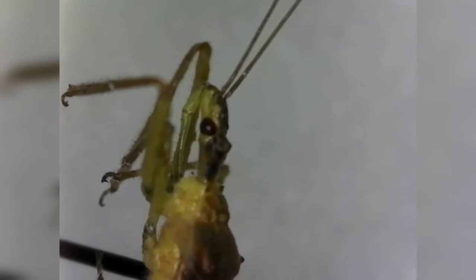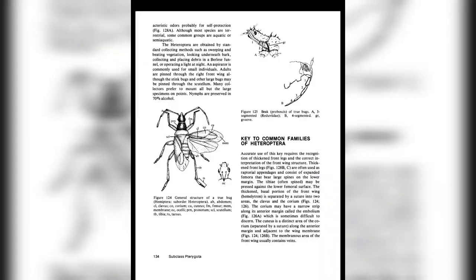First we're going to take a look at the beak to identify the suborder. We can see here that the beak arises from toward the front of the head, and that tells us this belongs in the suborder Heteroptera.